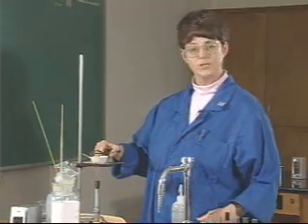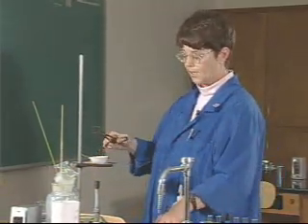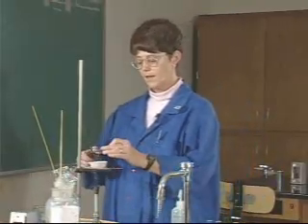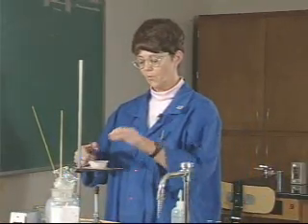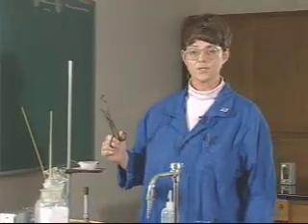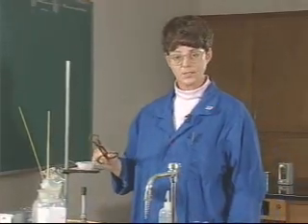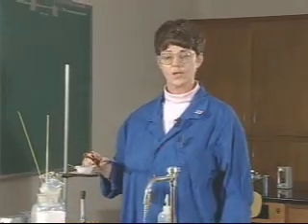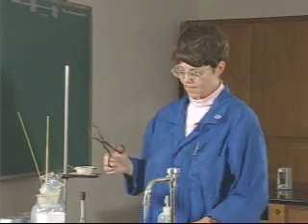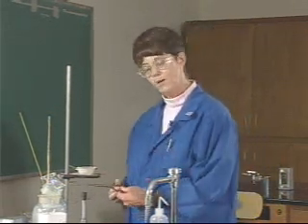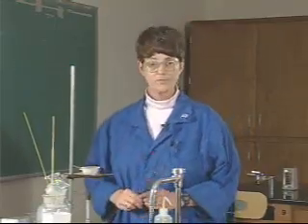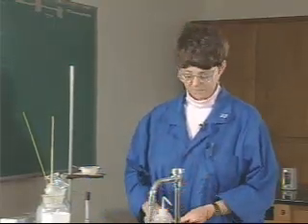We actually need to heat the evaporating dish just a little bit more with the cover on this time, in order to ensure that all the water has been removed. So I'm going to put the evaporating dish back onto the wire gauze, cover that with a watch glass, and gently heat it until all the condensation that appears on the watch glass at first has gone away. While that's heating, I can use the hot water to finish Part B of the experiment.